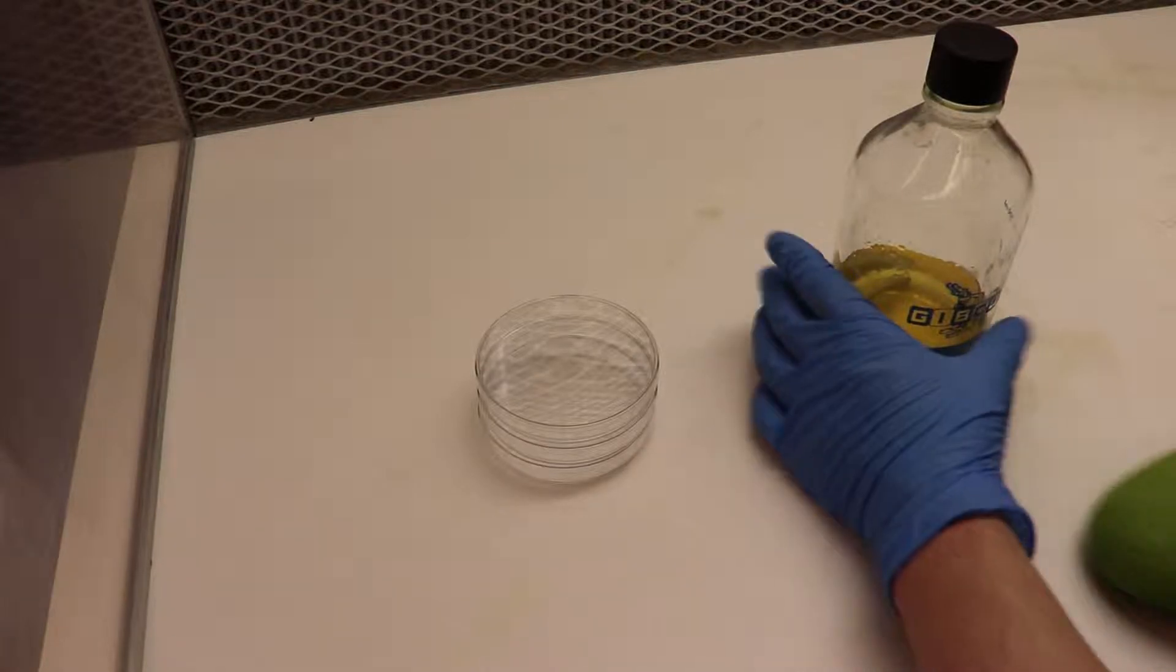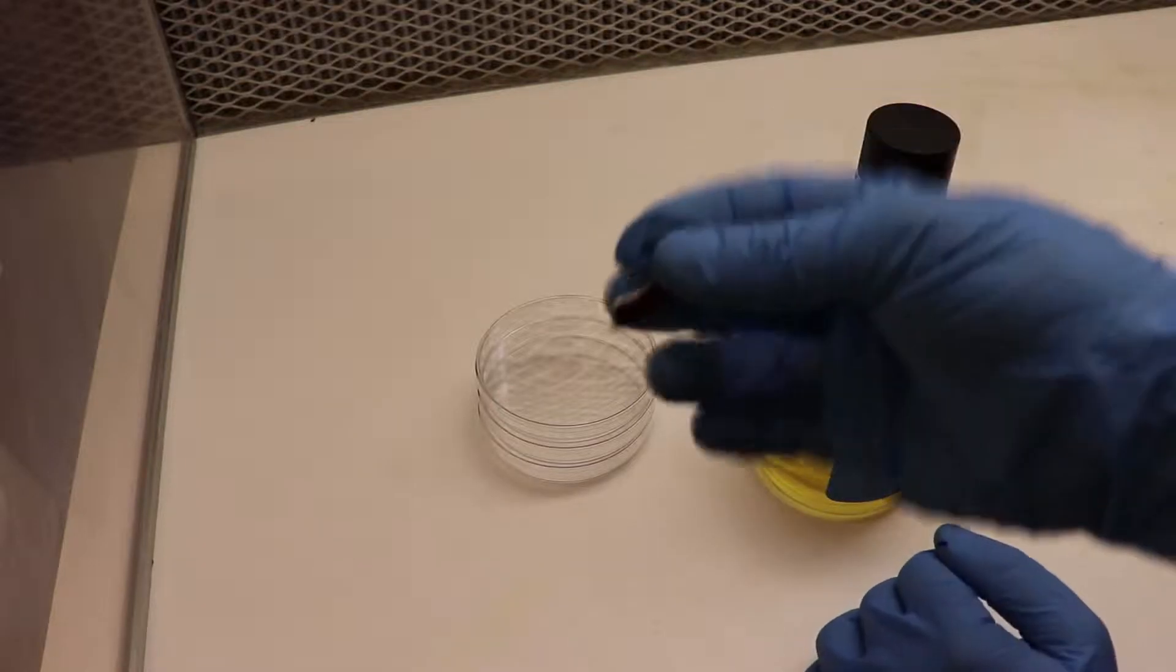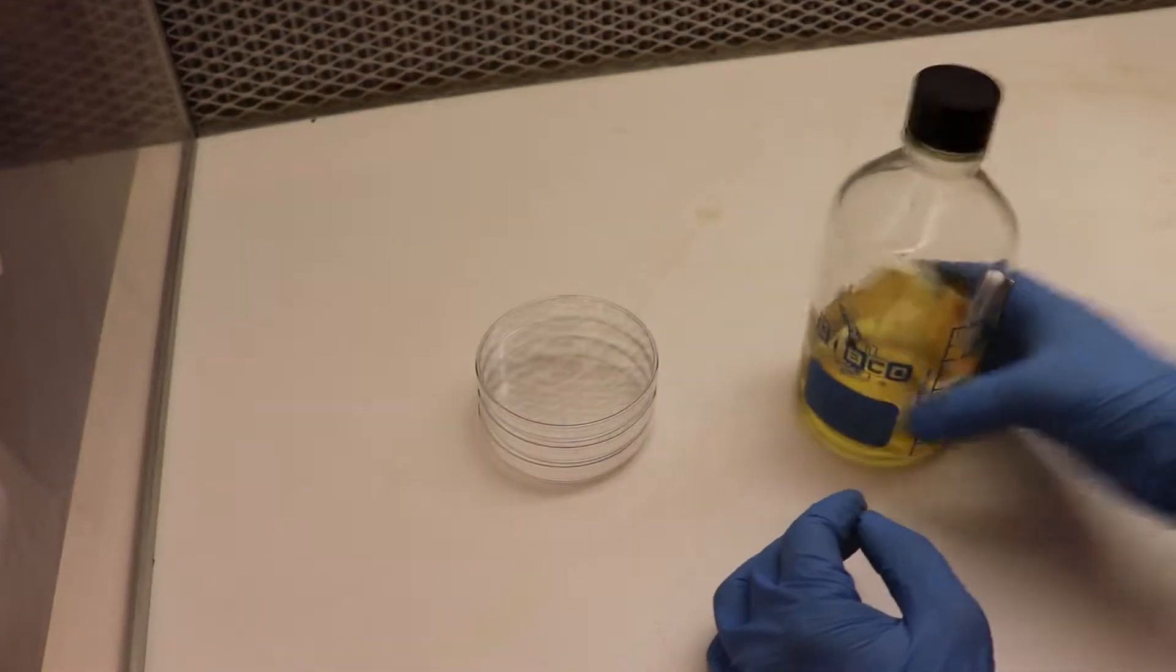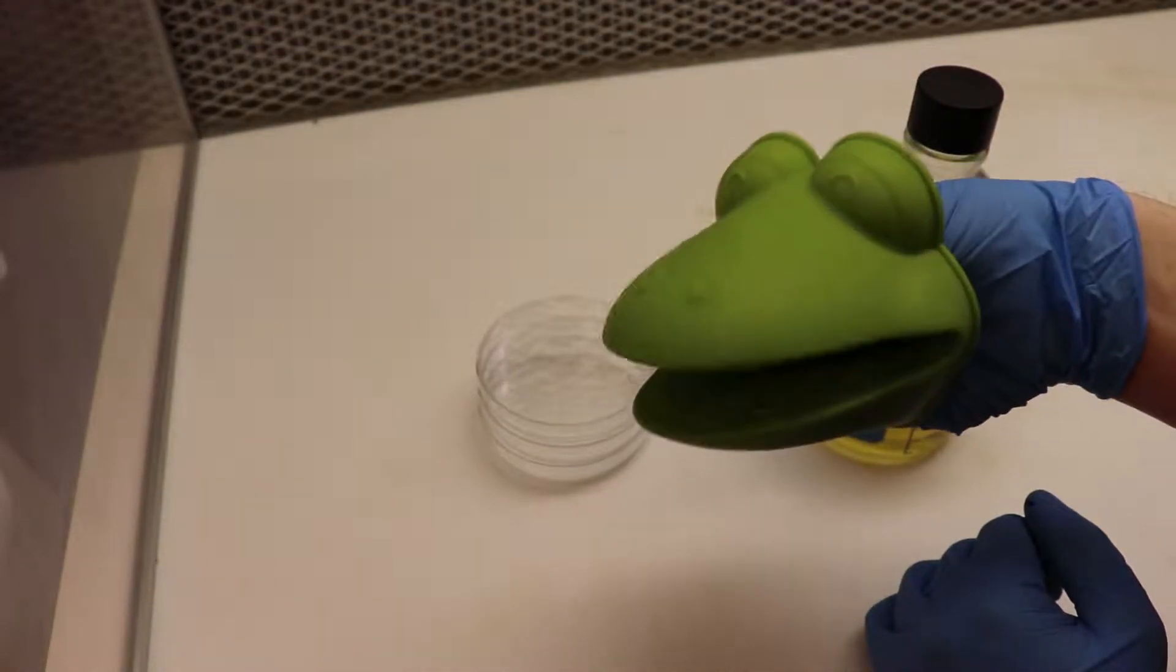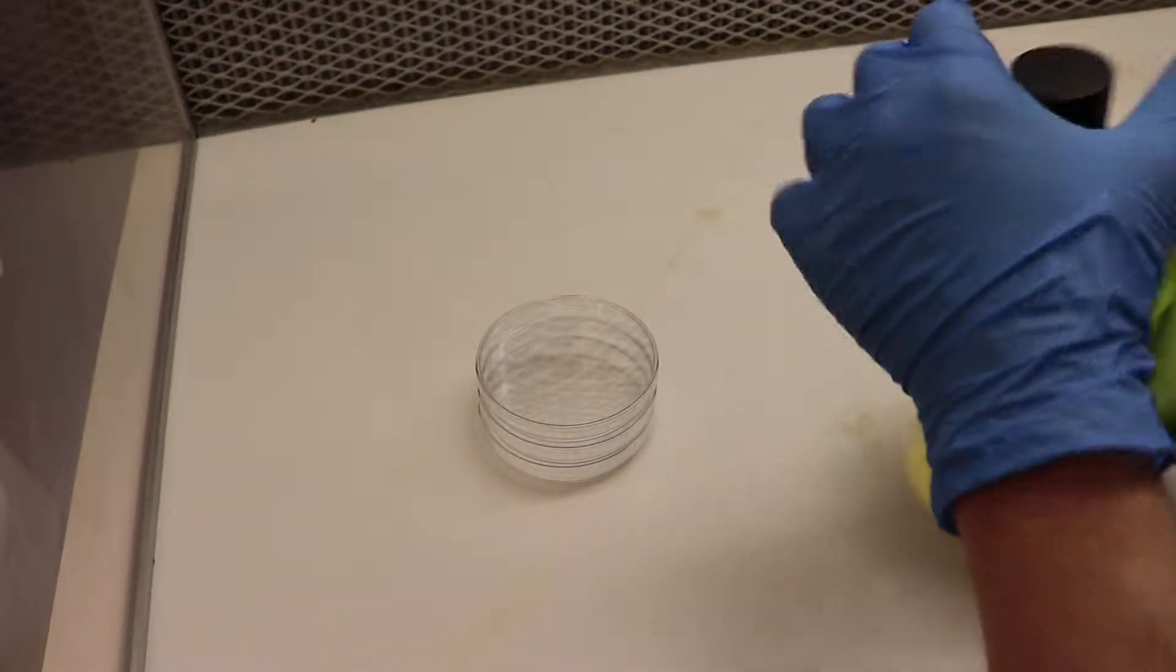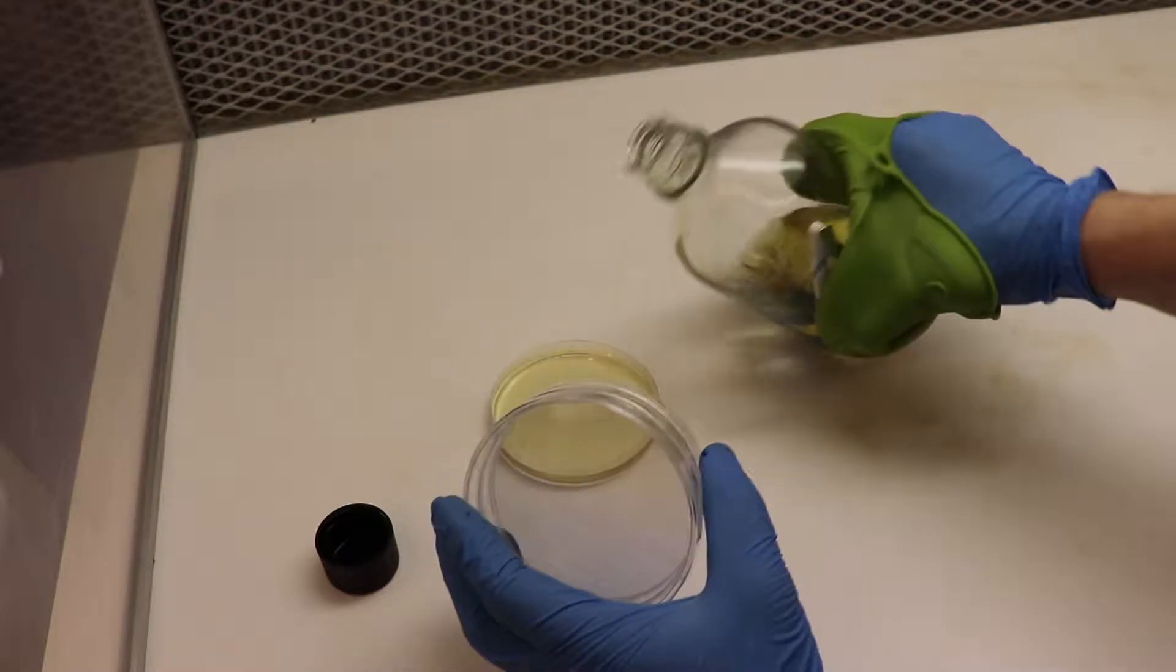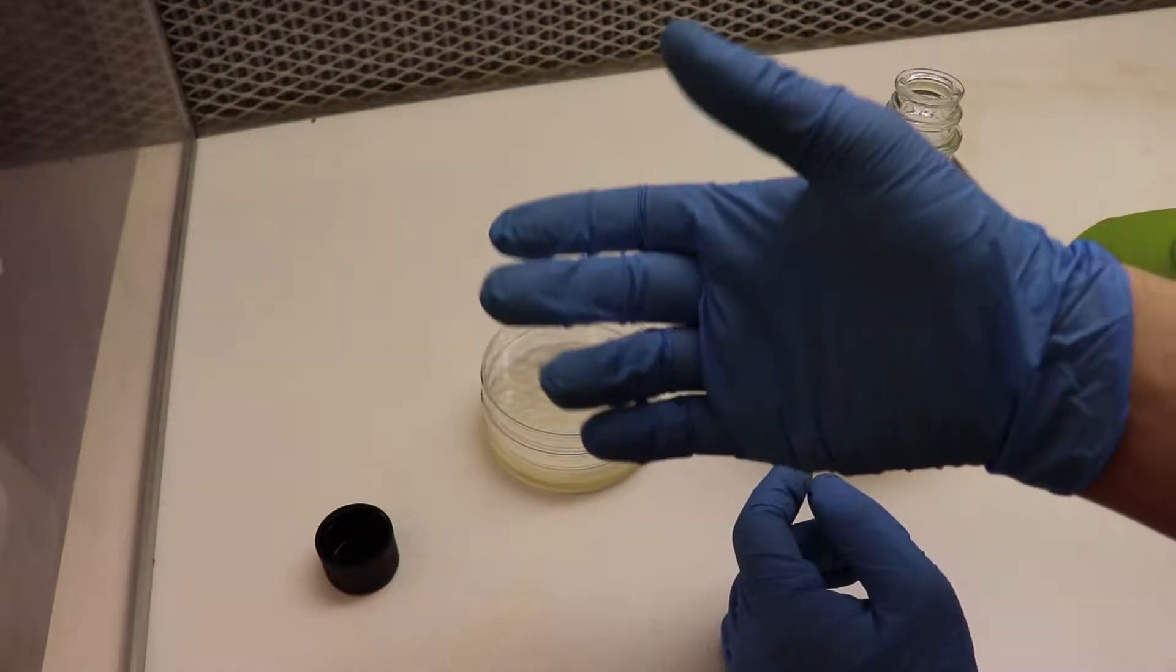And there we are guys. We're ready to pour. Get a magnet. This one was salvaged from a hard drive. Use it to hold your stir bar on the side. Get your friendly bottle holding pal. And pour your plates. I'm just going to use my bare hands.